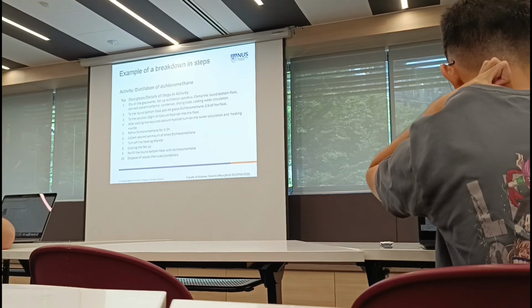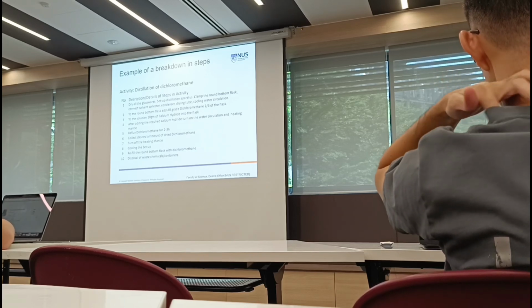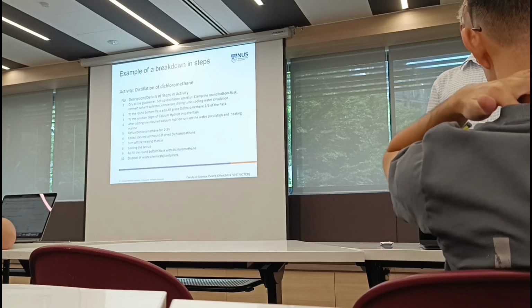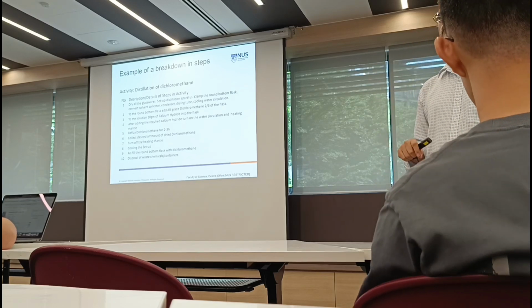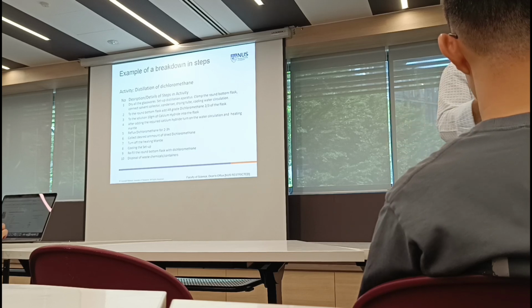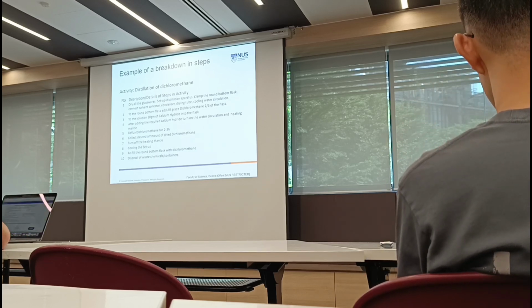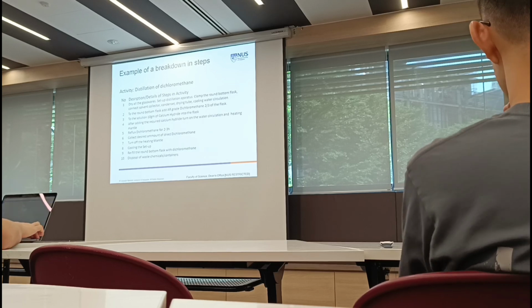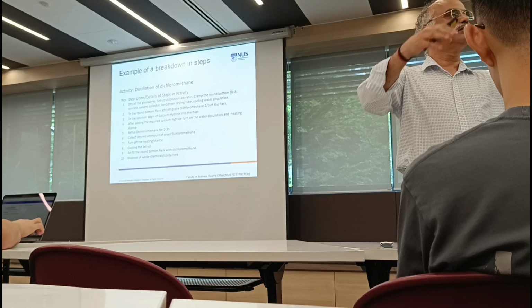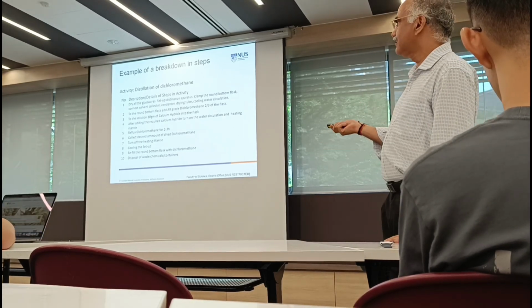Distillation of dichloromethane, right? Very simple one, we know that. But if you divide that into multiple steps, you will see how easy it is or how difficult it is. Some steps may be tougher than the other ones, right? And that's where it helps you to identify the hazards involved in this whole process. If we just take it as a distillation of dichloromethane, you would not have identified all the hazards associated with it, right? So that's why it is broken into multiple steps.